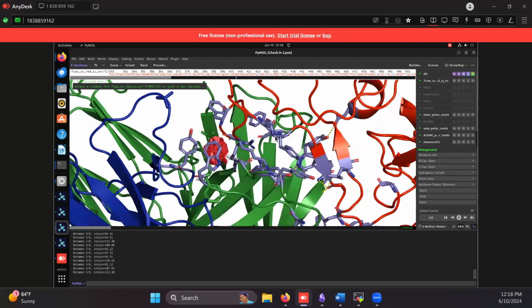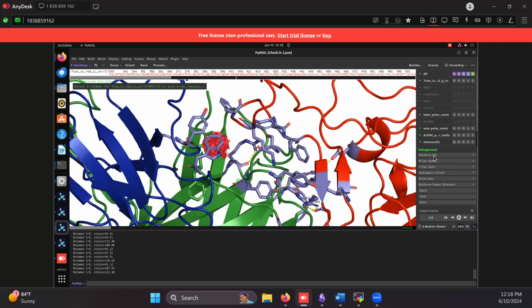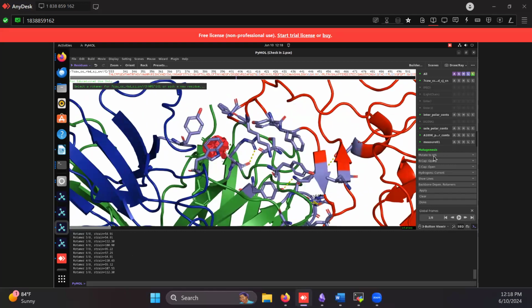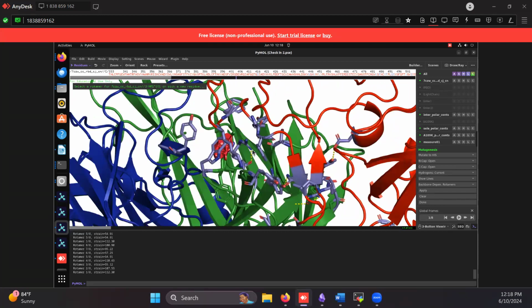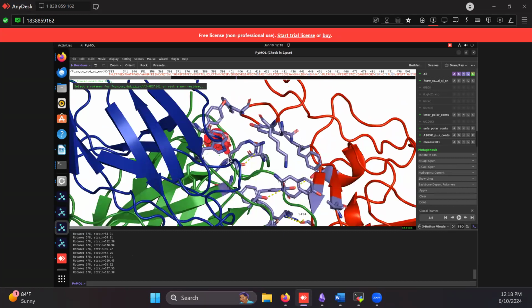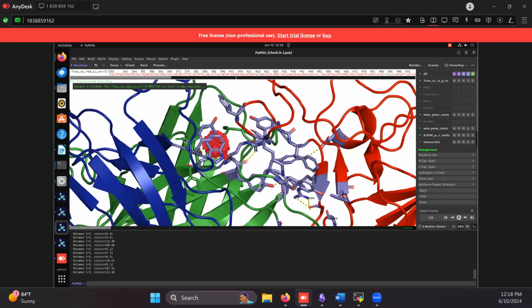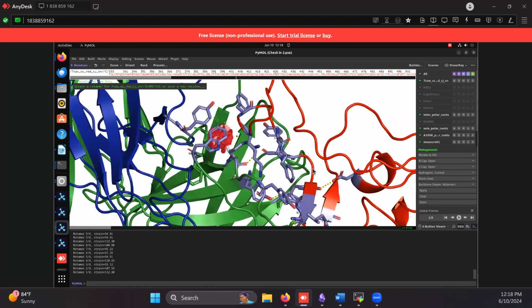These red boxes are showing steric hindrance. So if we mutate this arginine to a histidine and select this rotamer, it's showing, hey, there's going to be a lot of steric hindrance. So this is probably not the way to go with our mutation. You can also make these not dependent on the backbone, but I think that's a bad idea because backbone dependent rotamers are probably better in this situation since it's a loop. This is a very, very specific example, but I think it's just a very interesting way to show, hey, PyMol can be used for a lot more than just making figures.